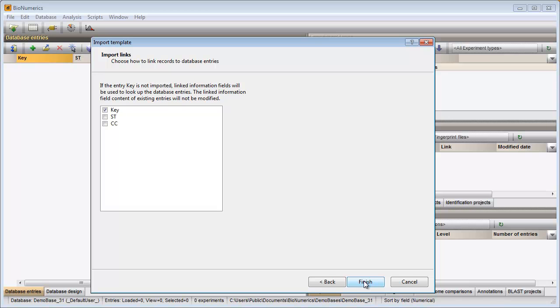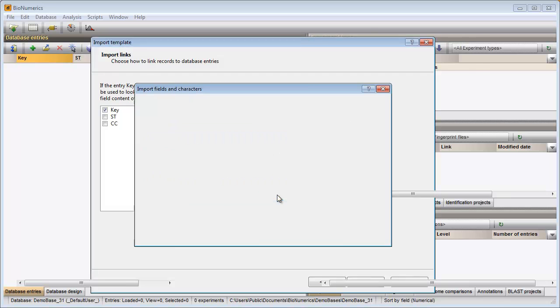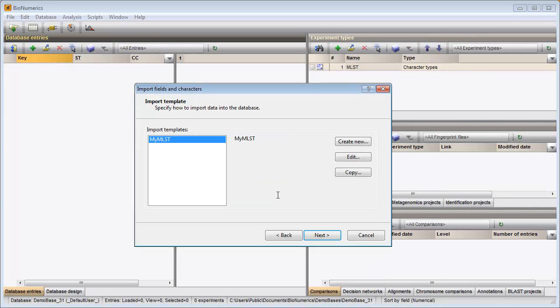As an entry link field I will use the key, as this is a unique identifier for my entries. A name for my template is prompted for. Pressing OK saves the template to the database.